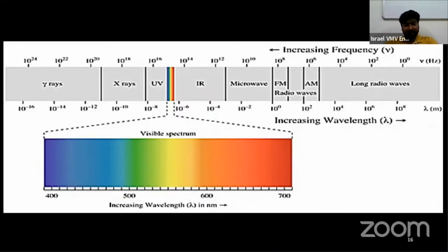The ultraviolet range again extends from 200 to 400 nanometer, and what comes next is the visible region that extends from 400 to 800 nanometer. Between 400 and 800 nanometer stands the entire visible spectrum: violet, indigo, blue, green, yellow, orange, and red. Red comes at a longer wavelength, meaning a smaller energy. Infrared radiation is therefore used for heating skin, heating flesh. They give infrared treatment for better blood flow. And near infrared radiation is suitable for application in biology.